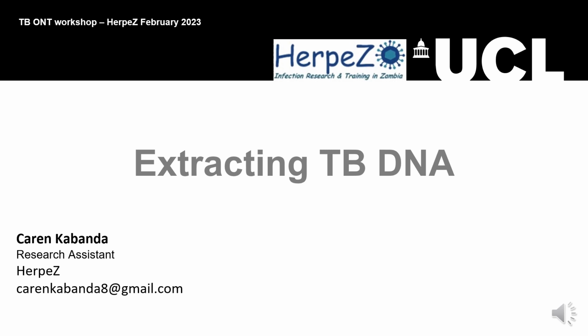So good afternoon, everyone. I'm going to be taking you through the extraction of TB DNA using the CTAB method.